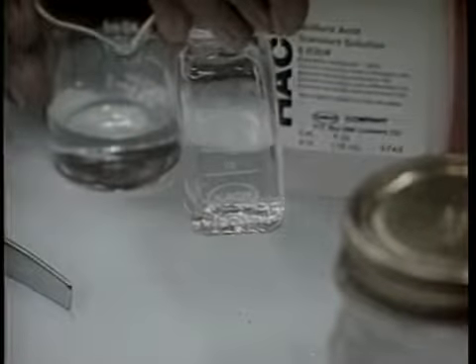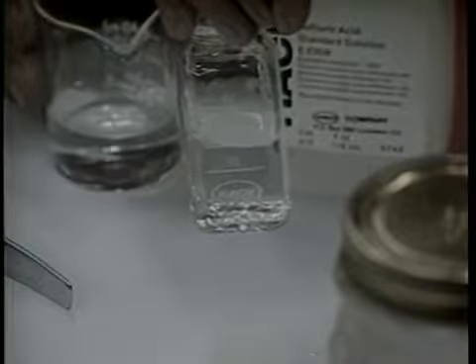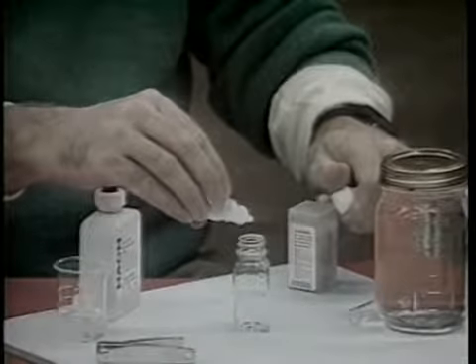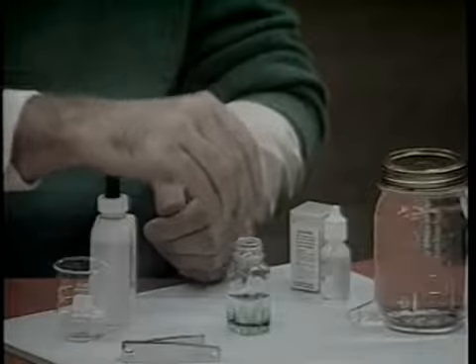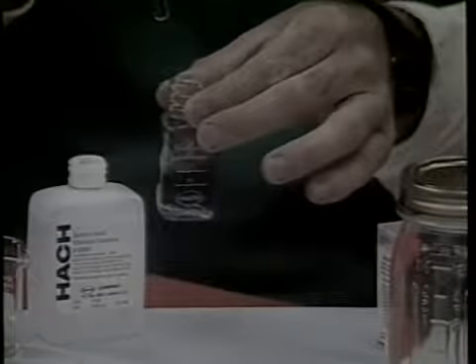To measure the total alkalinity using the low-range test, proceed as follows. First, fill the mixing bottle to the 15 milliliter mark. Proceed as in the high-range test. Add phenolphthalein indicator solution and sulfuric acid solution if necessary. Then add a bromocresol green methyl red powder pillow, and then sulfuric acid until the endpoint or color change is reached.